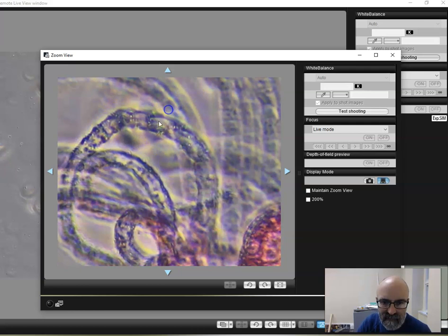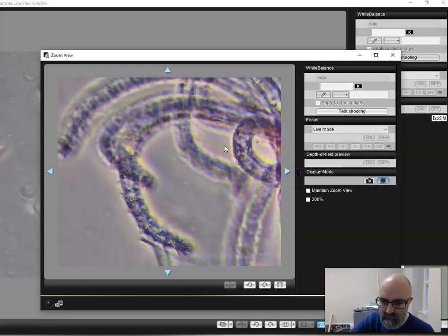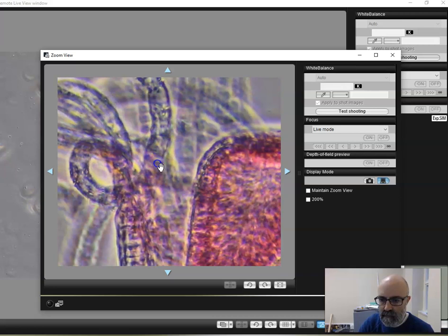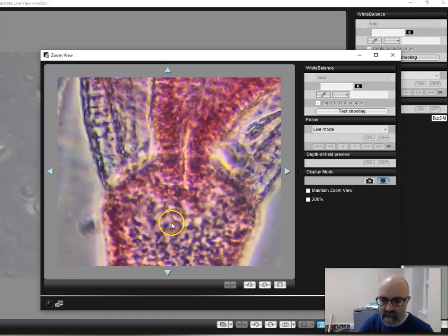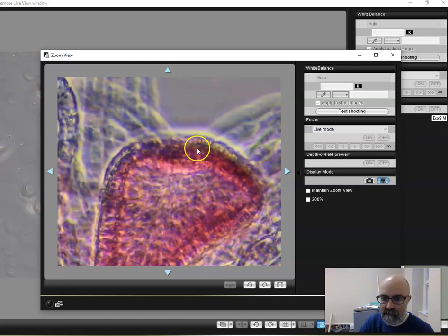You can see the individual cnidocytes on these guys. So those cnidocytes are those stinging cells that give a jellyfish its stinging abilities. And let's see the little barbs sticking out of them. Those are the triggers on the cnidocytes. And if we move over, here is the gastrovascular cavity, and the mouth would be right down in here, right? Or no, other end. The mouth would be up at this end. Okay.